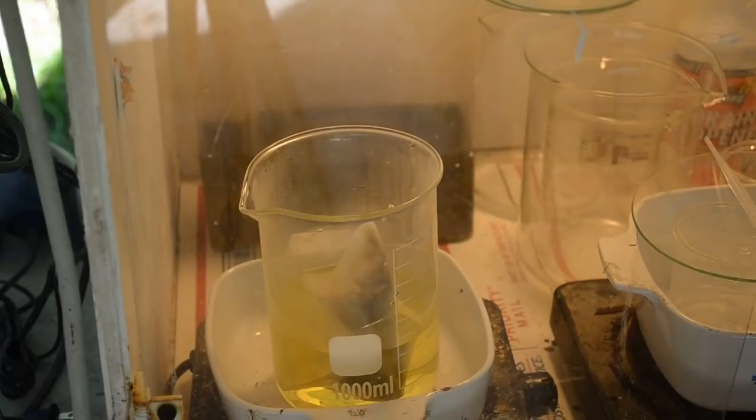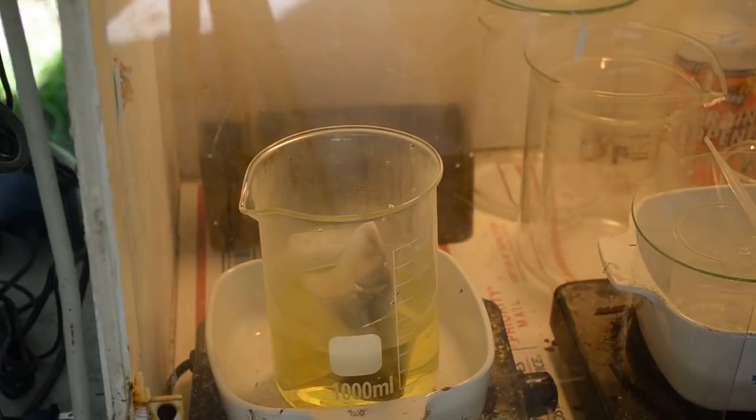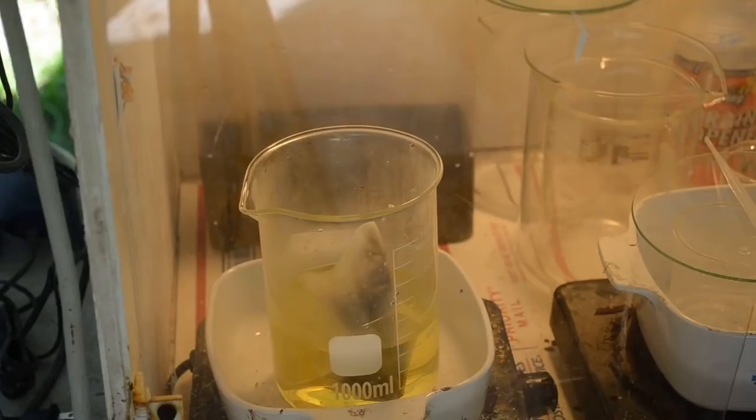And hopefully we've gotten rid of a lot of the impurities. I strongly suspect, I mean, there was obviously copper there. There's probably platinum group metals. Okay, that's a little over 6 milliliters. I'm going to leave it at that for the moment. And we'll see how this goes. Yeah, so there's copper, there's probably platinum group metals.